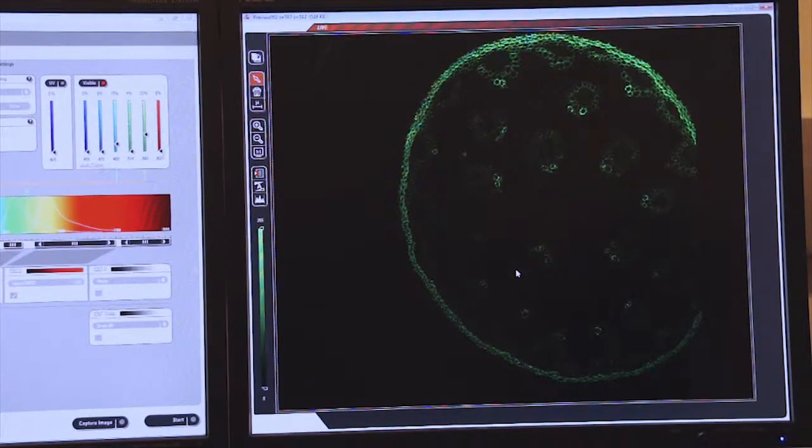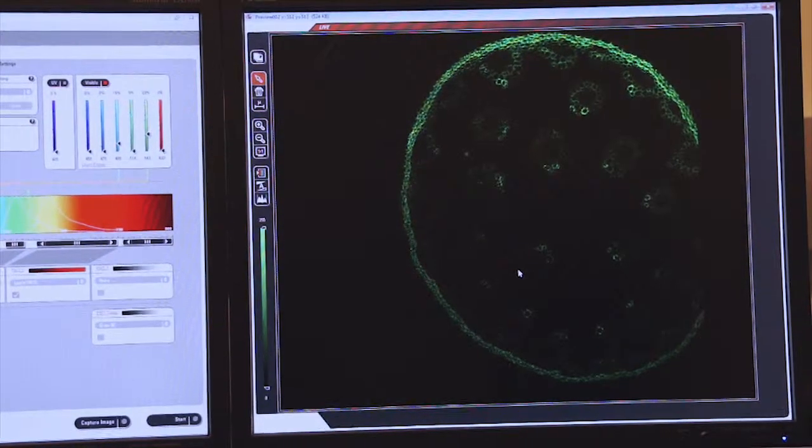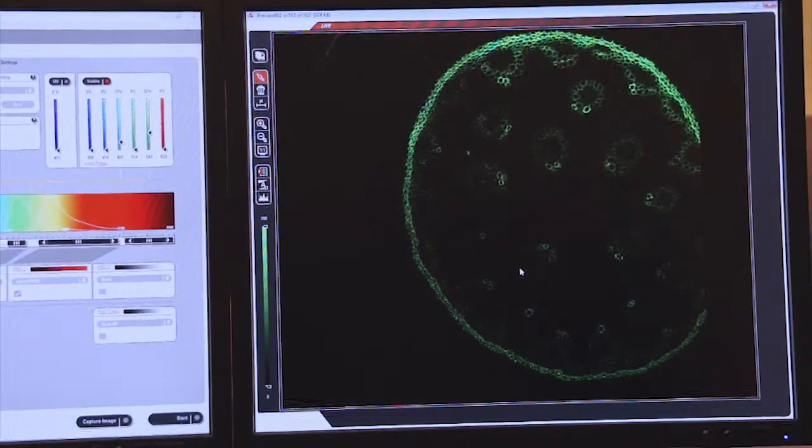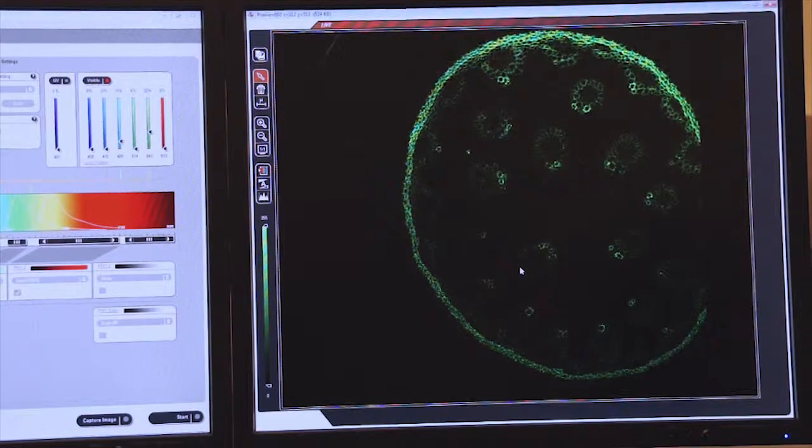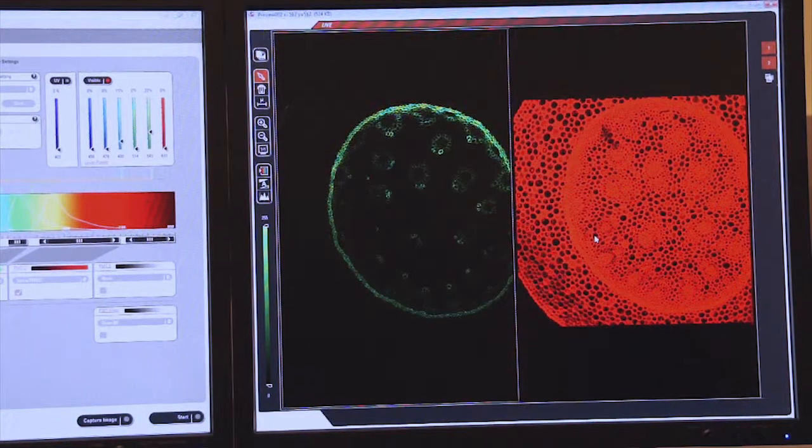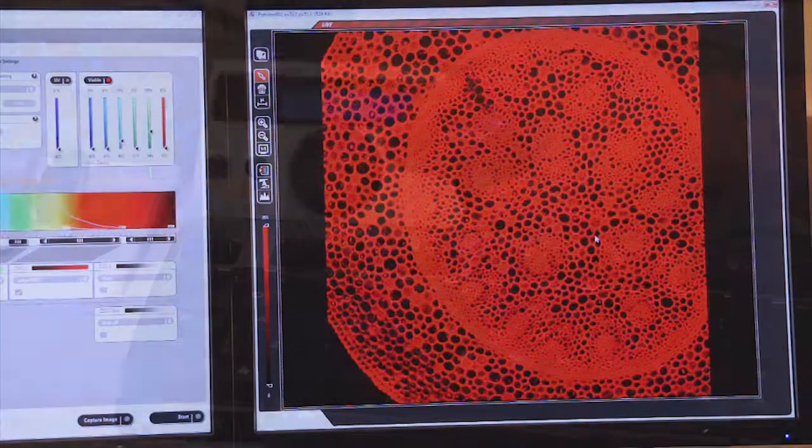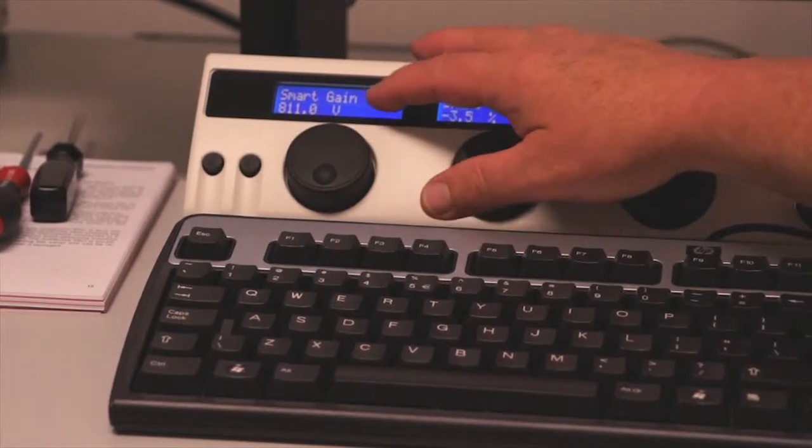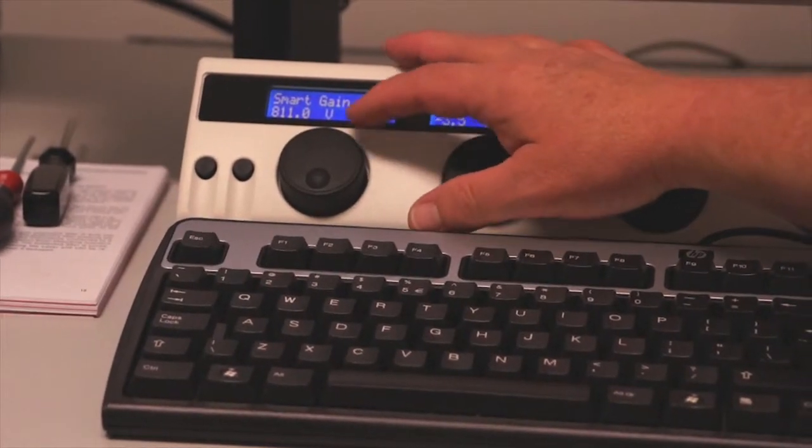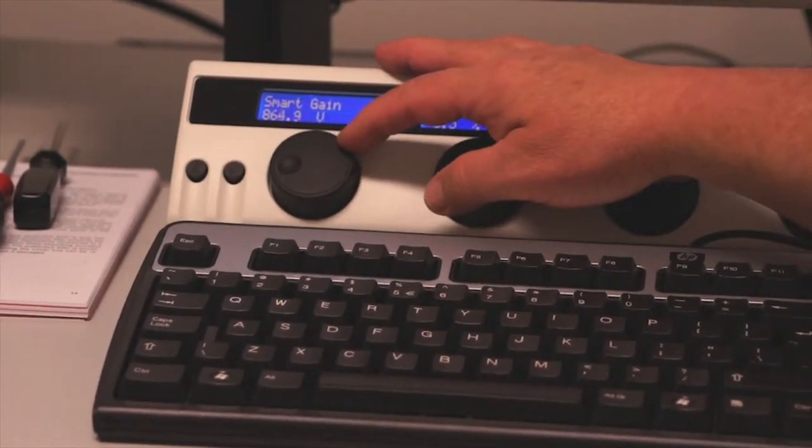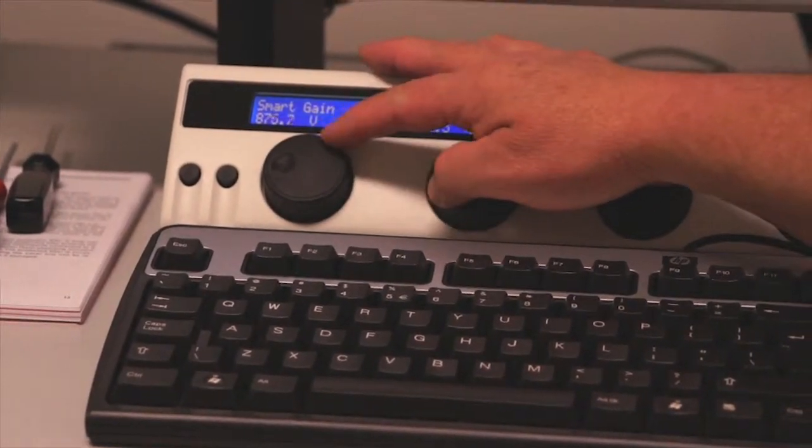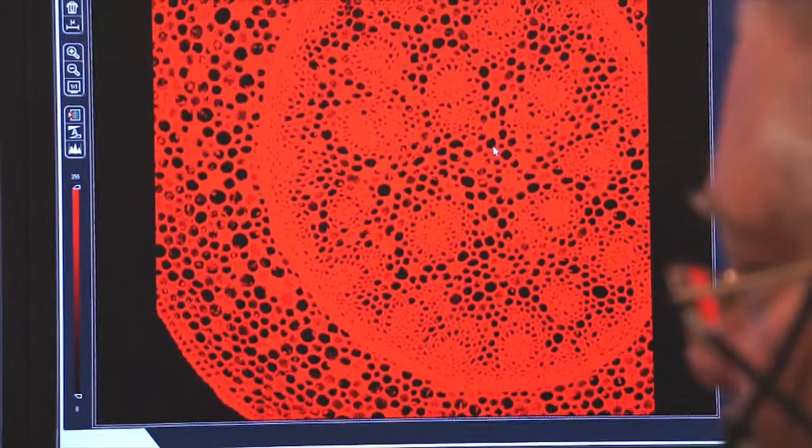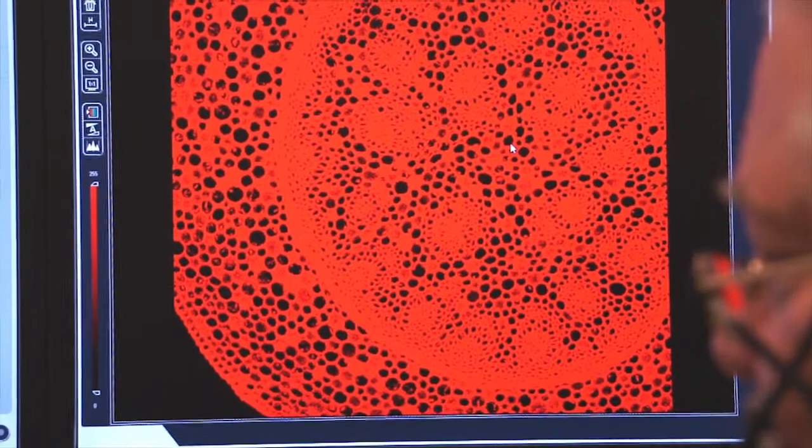We double click on this screen again. Now we can click on the right screen and control the smart gain for this image as well. Once again, we're looking for a smart gain of about 900 volts. And so you see here, I'm raising the voltage to about 900.